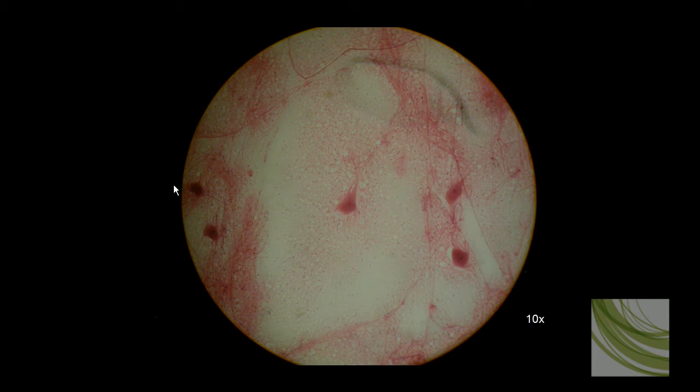And we see several more cell bodies but telling apart dendrites from axons looks a little difficult. Remember this is a three dimensional slide so things can be laying on top of other things which makes it a little hard to distinguish sometimes.